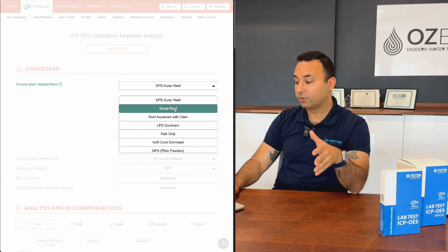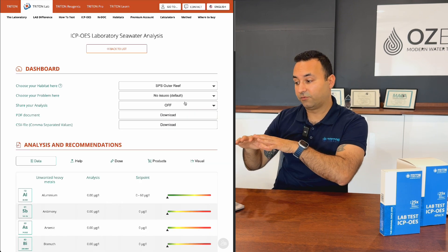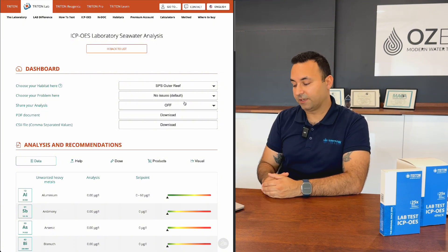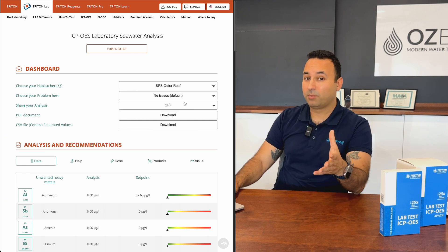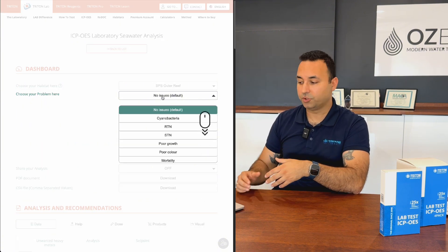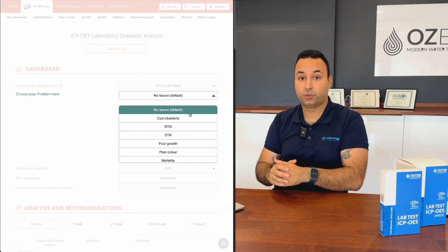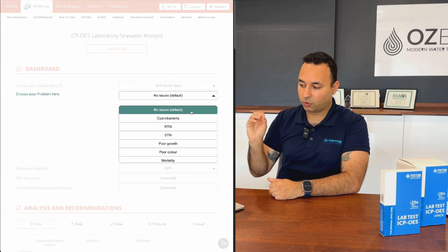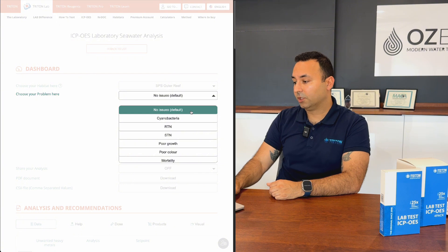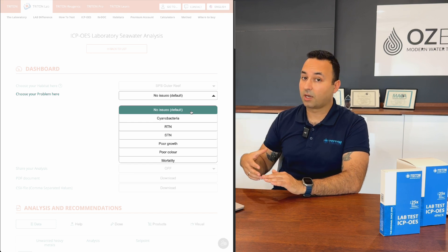You choose your habitat — for example, SPS from the outer reef, mixed reef, LPS dominant, fish only, or soft coral dominant — and the intelligent recommendation system adapts accordingly. The dashboard also has a 'Choose a Problem' option. If you're experiencing an issue like poor growth or RTN/STN, telling the system about it changes the recommendations and help approach it provides.